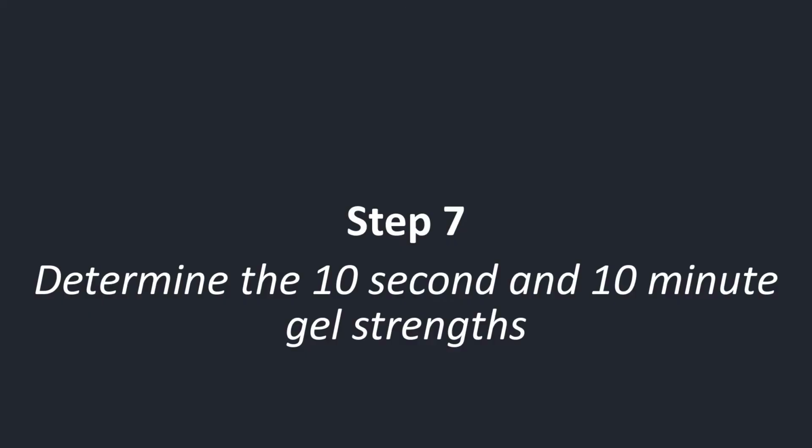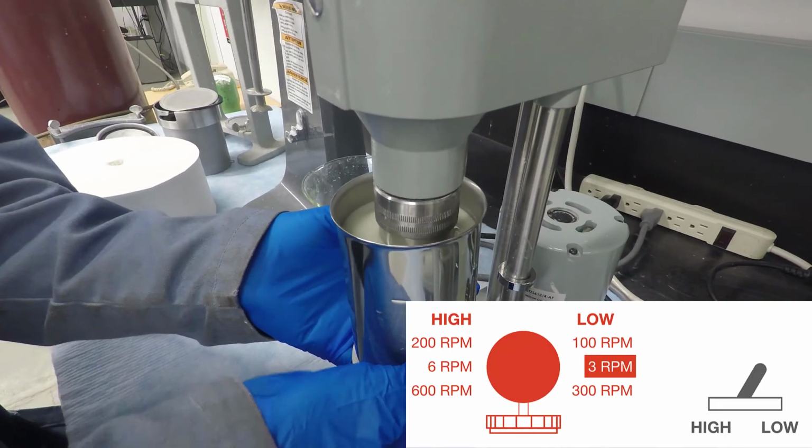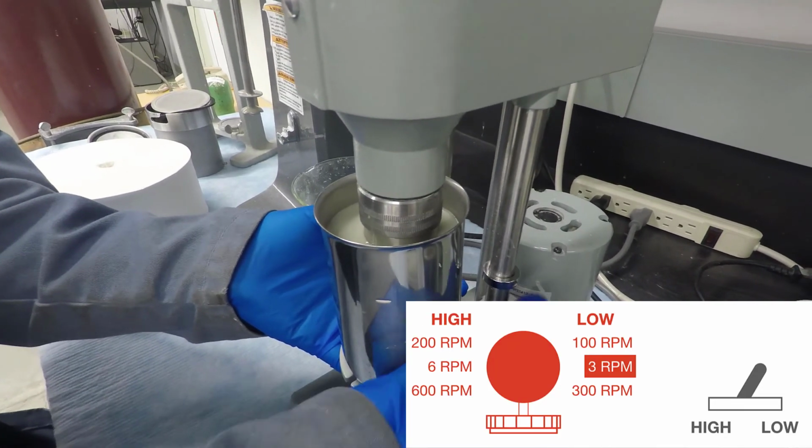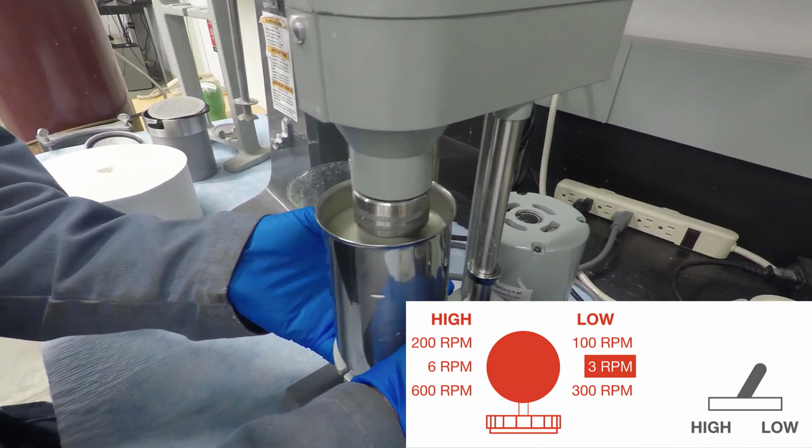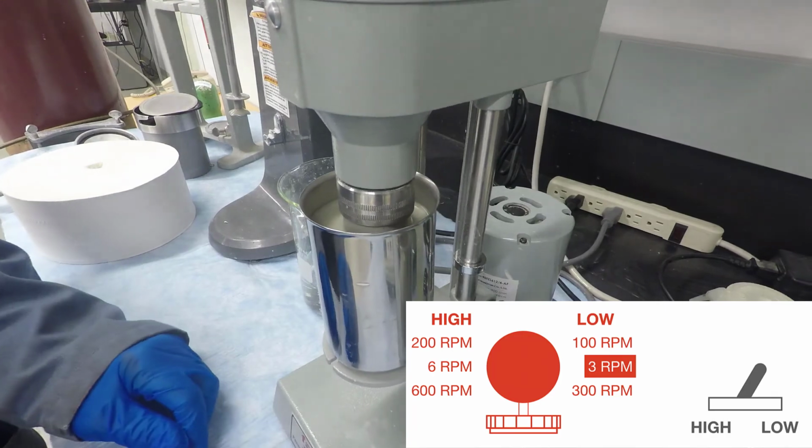Determine the 10-second and 10-minute gel strengths. The gel strength reading needs to be taken at 3 RPM. For more information on this, refer to the top section of page 18 in the lab manual.